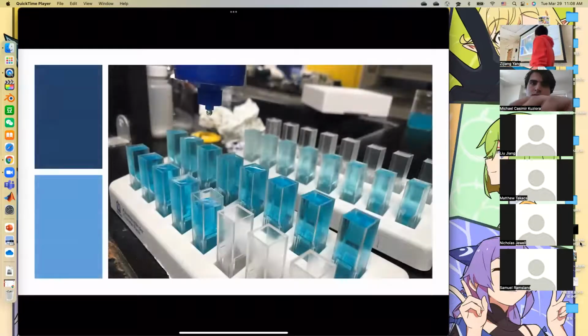And here is an experiment from several years ago, for 11, we had some experiments like this. We have some outflows, and then we collect the concentration of the outflow. We can see the concentration gradually increase. And then we use UV-Vis to measure the concentration. But because this experiment is a little bit unsafe, we just removed it.